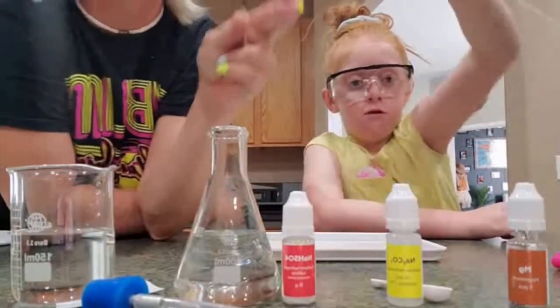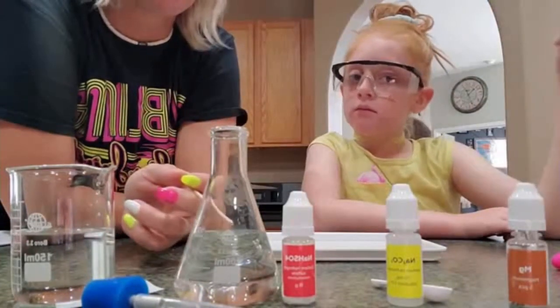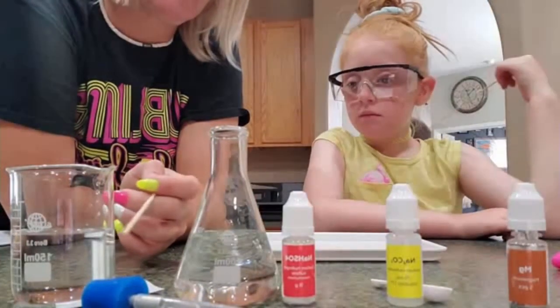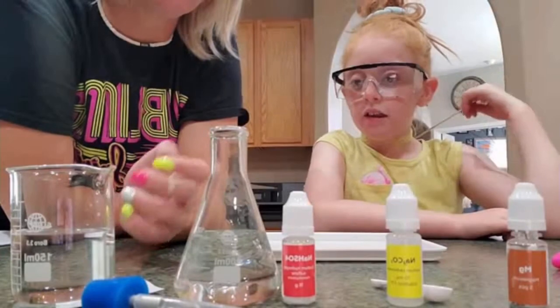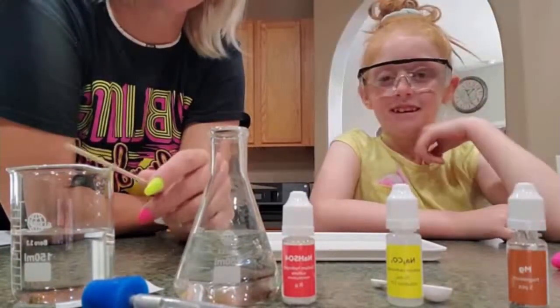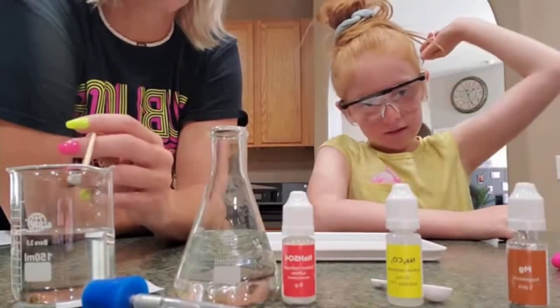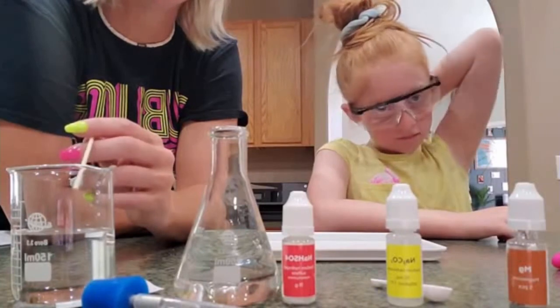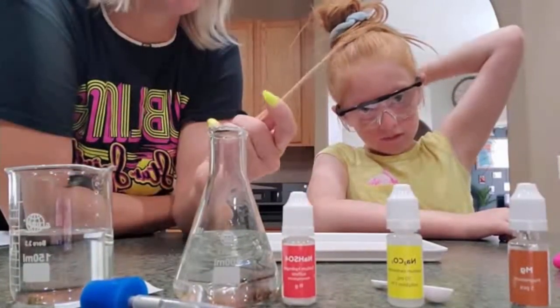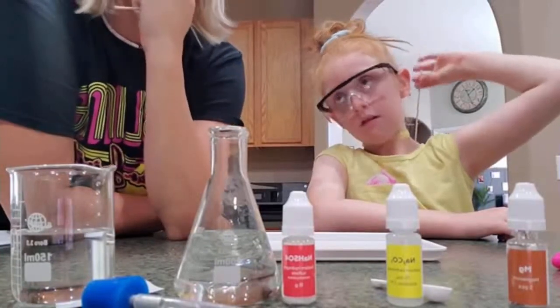Then we'll be swirling some things together, and hopefully if everything goes correctly, we will be making foam build up in our beaker right here. This is a flask, and this is a beaker. So hopefully we are going to have some foam start building up in our beaker over here, and then we'll be able to light one of our splints on fire, touch it to the foam, and see what happens.